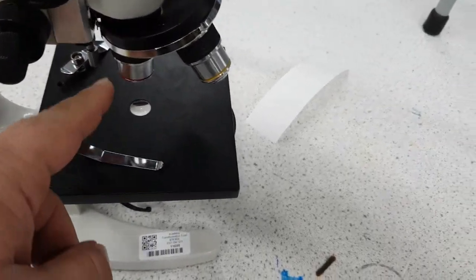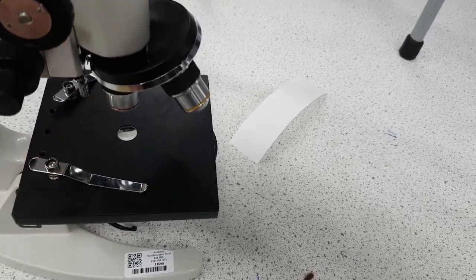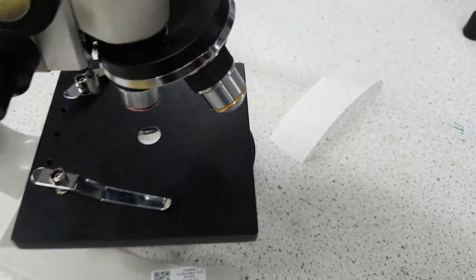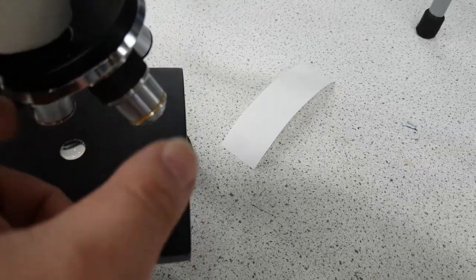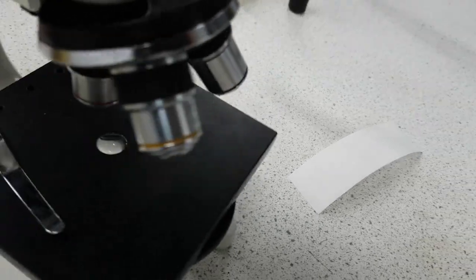In other words you can see the most using this small one and you need to know that this one has the most range or field of view. Then the second most magnification is the yellow one, and after that it is the black one or dark blue, so that has the highest magnification.